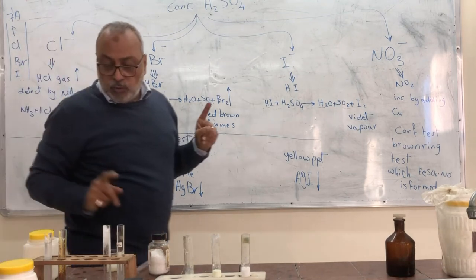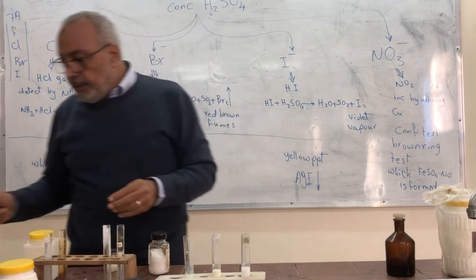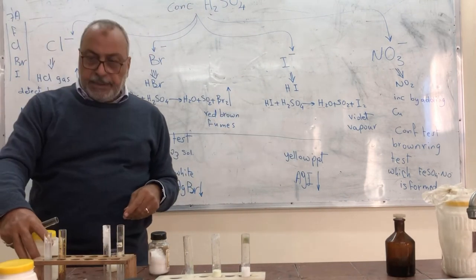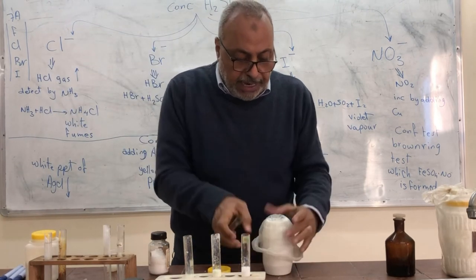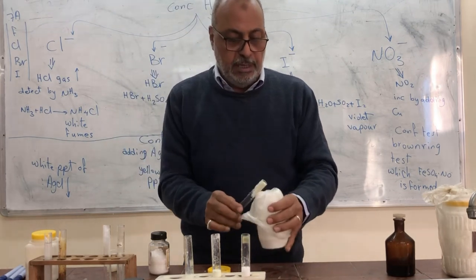The last one in this group is nitrate. We can get sodium nitrate and add conc hot sulfuric acid, H2SO4.